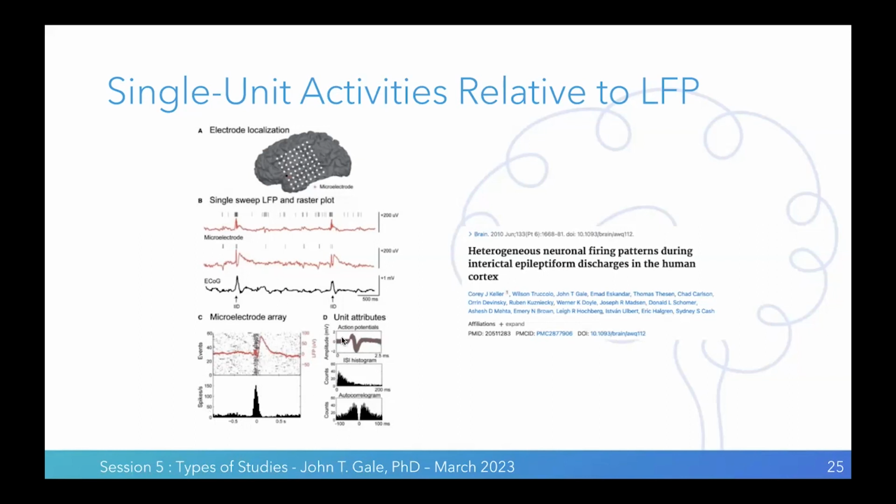Each hash here shows how the neuron fired relative to the spike. You can see there's some basal activity, then a rapid firing right around the interictal spike. Then the neuron slows down and has some activity. Again, the next spike, we have a rapid increase in activity. Over here just shows how we templated the neurons and the basal activity of how the neurons fire. This is a great utility. We showed, hey, in this case, this particular neuron increased its activity right before the interictal event.